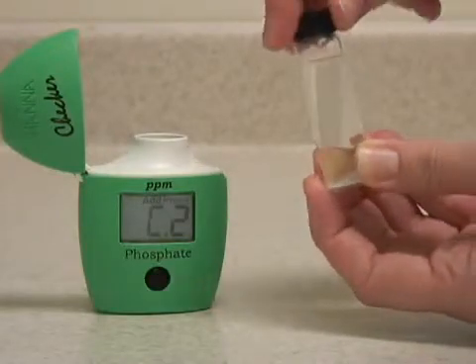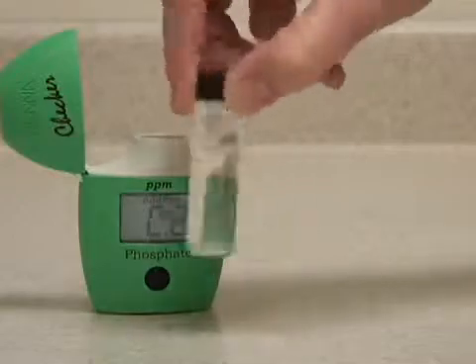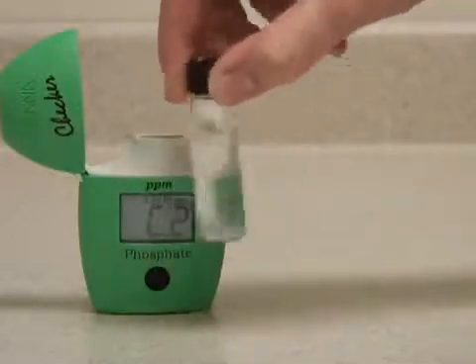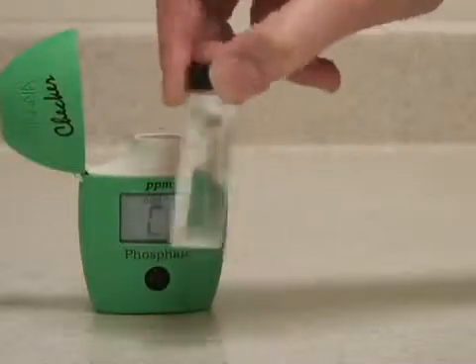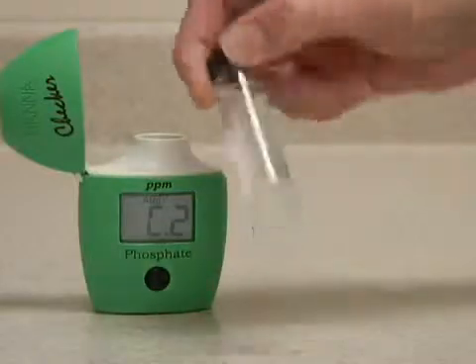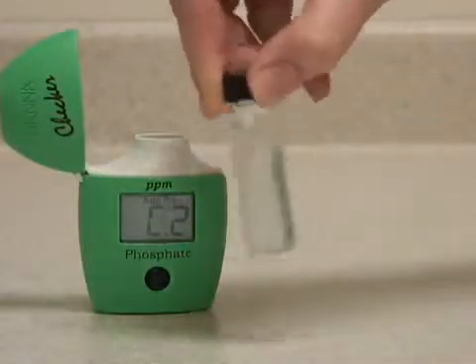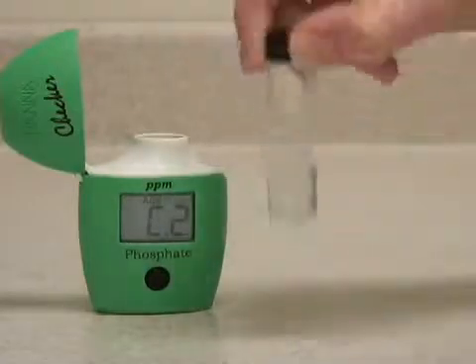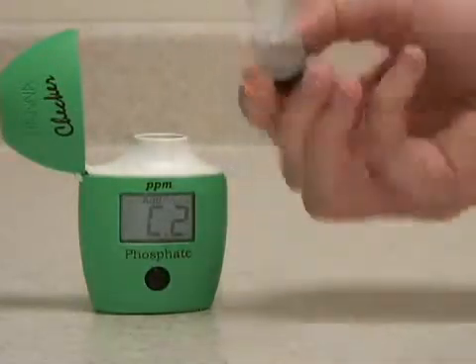Put the cap back on and shake gently to dissolve the sample. Try to avoid shaking it too vigorously, as shaking it too much can introduce micro bubbles that will alter your reading. The best way to do this is to swirl the vial gently, or invert it, until the sample is mostly dissolved.